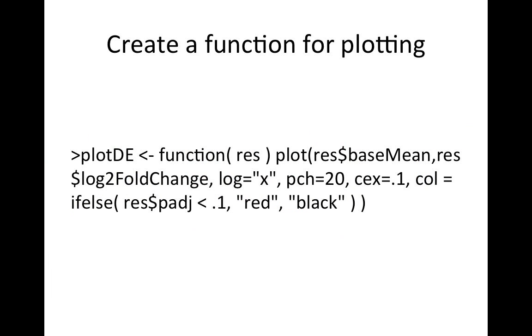So once you've got the results, you're probably going to want to plot to see how they look. So here's how I built the plot function. I don't think you have to do this anymore. I'm pretty sure DESeq now has a function in it that will draw a plot from your results, but you'll have to look into the manual to find out that.